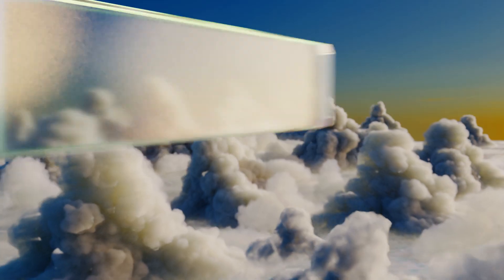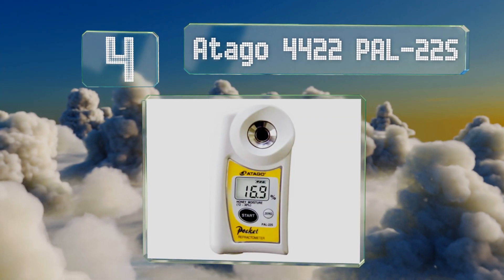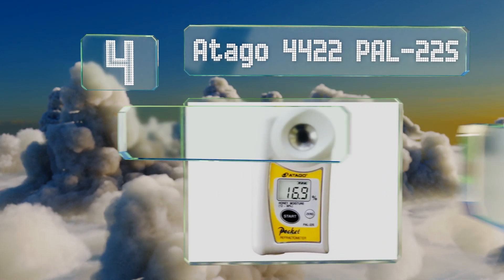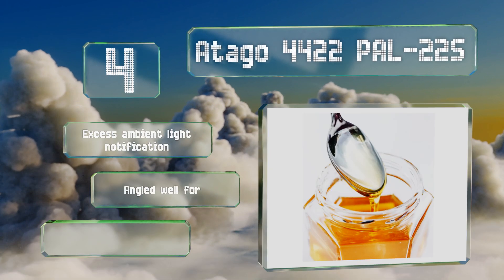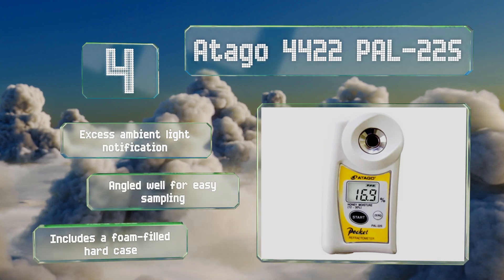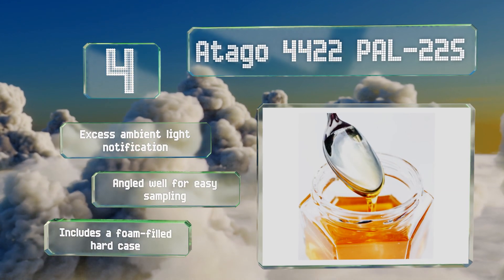At number 4, if you're a commercial apiculturist, the lab-quality Otago 4422 Power 22S is a smart choice. It can tell you exactly how much moisture is in your honey, as long as it falls within a 12 to 30 percent range, and with an accuracy of plus or minus 0.2 percent. It features an excess ambient light notification and is angled well for easy sampling. It comes with a foam-filled hard case.